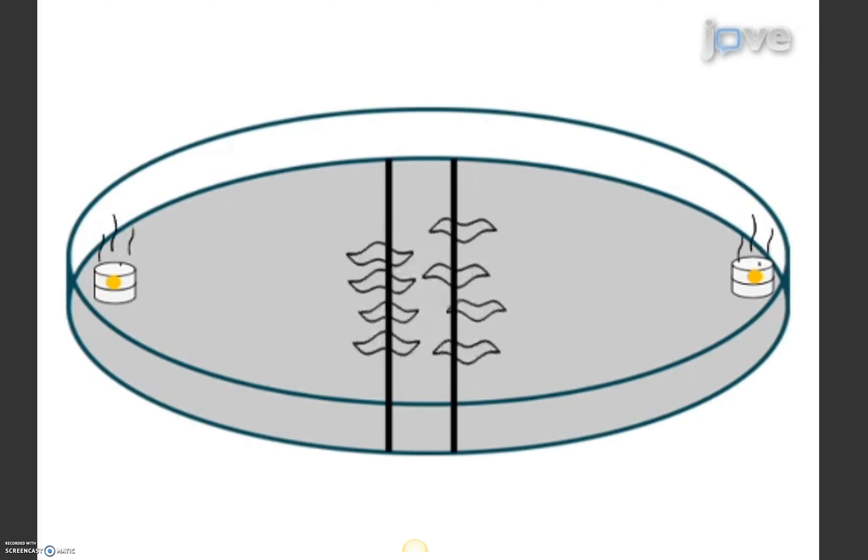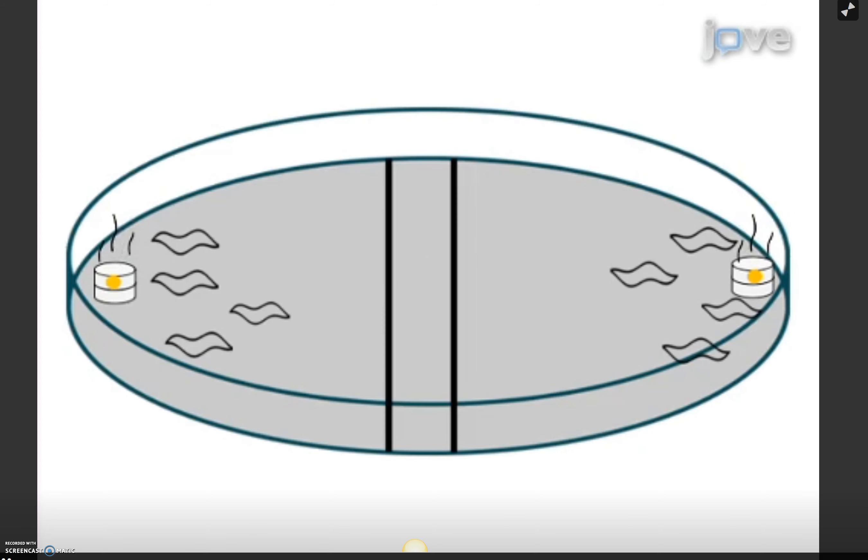Next, the larvae are trained for 5 minutes on a petri dish with fructose as a reward, and an odor container on each side that contains 1-octanol as an olfactory stimulus.